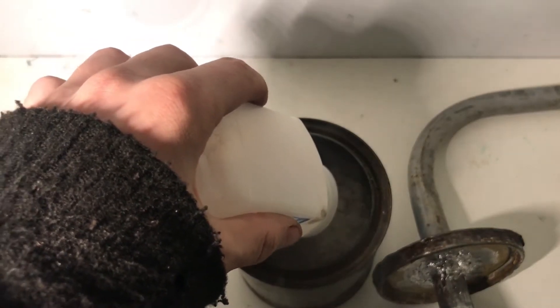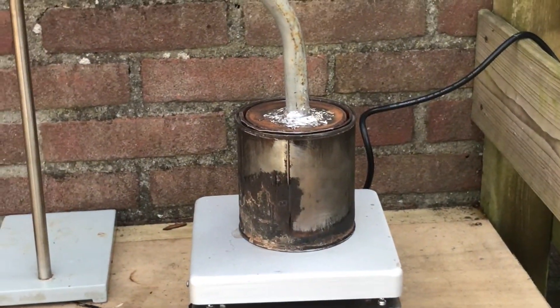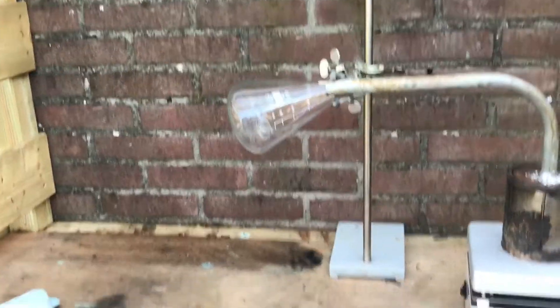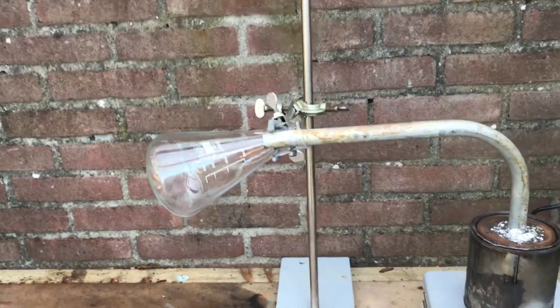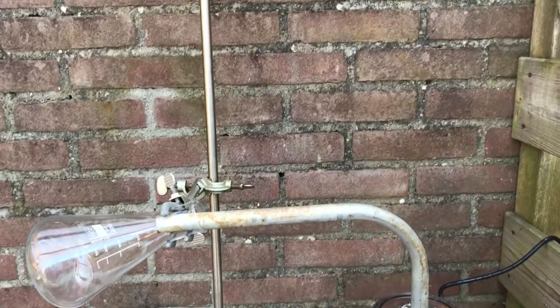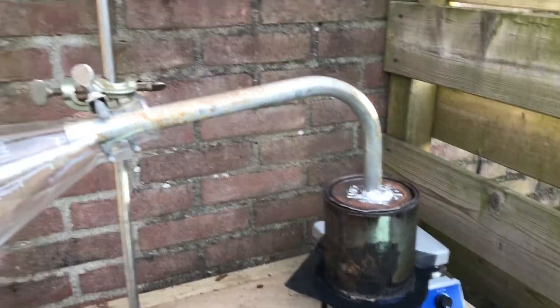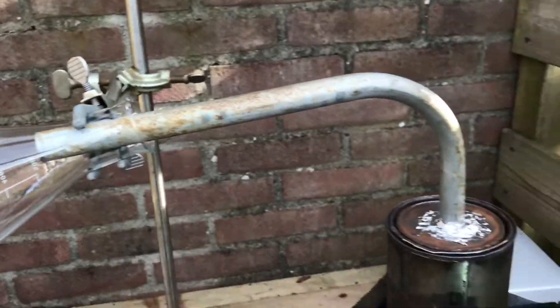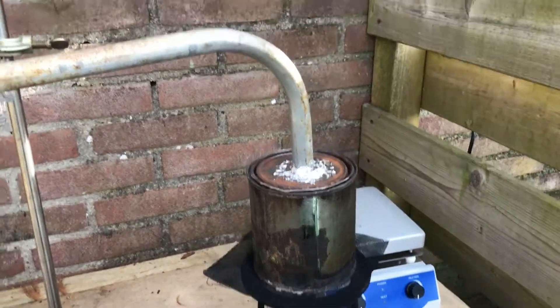Don't breathe in the dust. So this is the setup — there's the calcium acetate. We'll heat it up and it will condense in here. I hope this thing gets hot enough; if not, I will switch to a Bunsen burner. I switched over to propane because it wasn't really getting hot enough. I do smell acetone — it smells very weird and sweet — but it just wasn't condensing, so hopefully it's going to condense now.